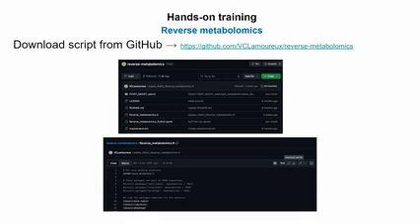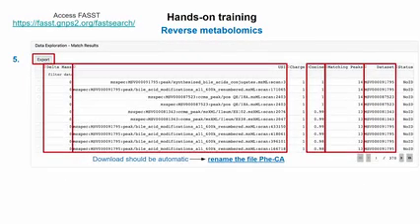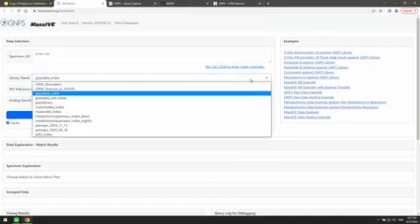While we're waiting, can you comment on the libraries, GNPS, data, index, and all of those? What differences do those make in terms of querying with MASST? What difference the library makes? Can you guide us in terms of what library we should be searching against? Because it's a pull-down menu. Oh, yeah. Yes, maybe while we are waiting, can we go to the live page? Not to the slide, but to the tool. I think we have it. Yeah, you mean here, right?